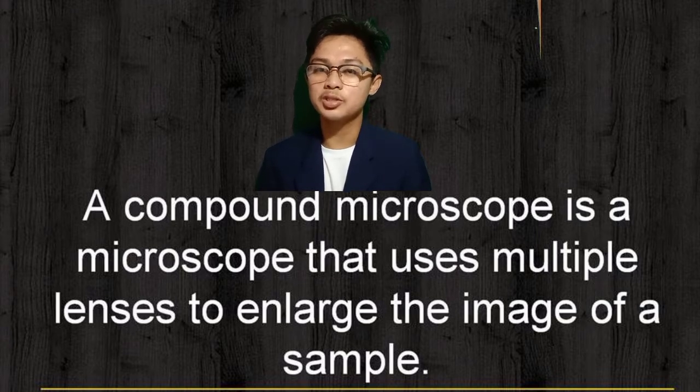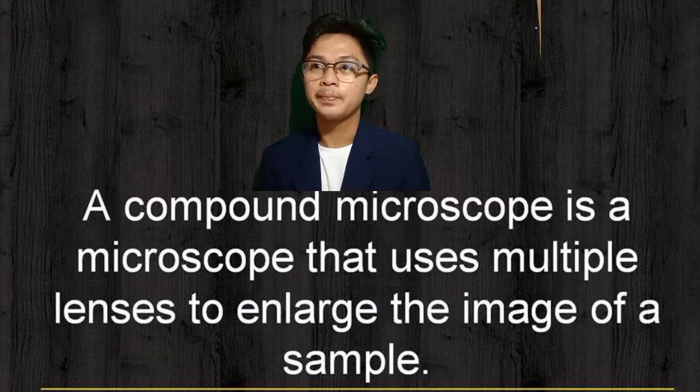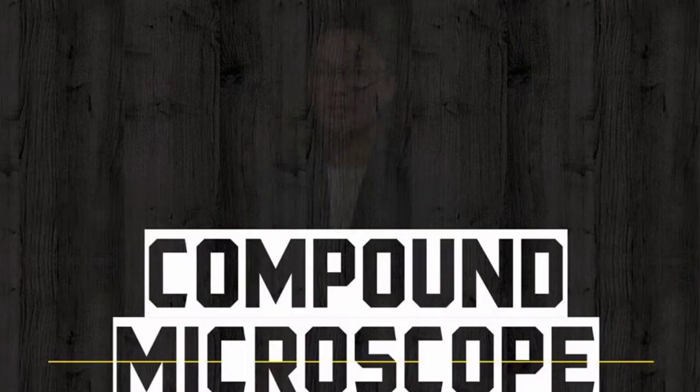A compound microscope is also an example of optical microscopy since it utilizes light to view objects. The compound microscope was well known when Anton van Leeuwenhoek used it to view a pond and discovered that it is made up of microorganisms, red blood cells, and other tiny organisms.